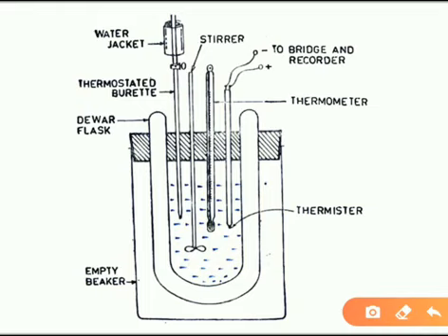Then we have the thermally insulated adiabatic titration vessel, called the Dewar flask. We have the U shaped vessel, so that is called a Dewar flask.